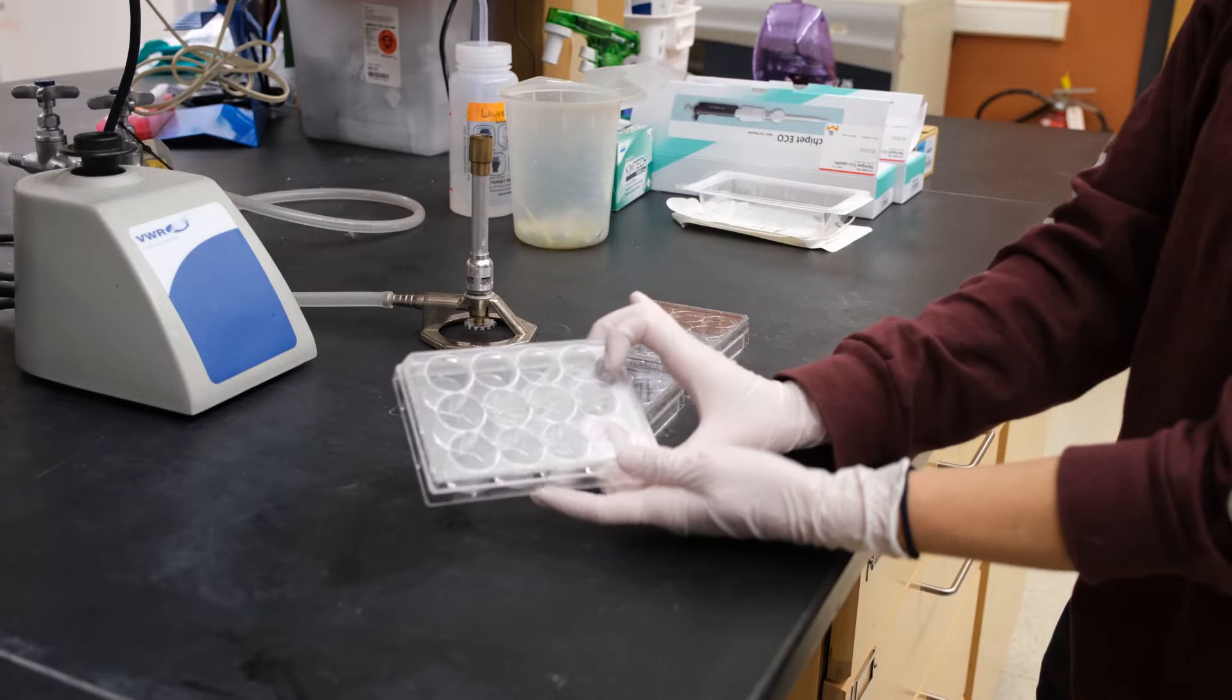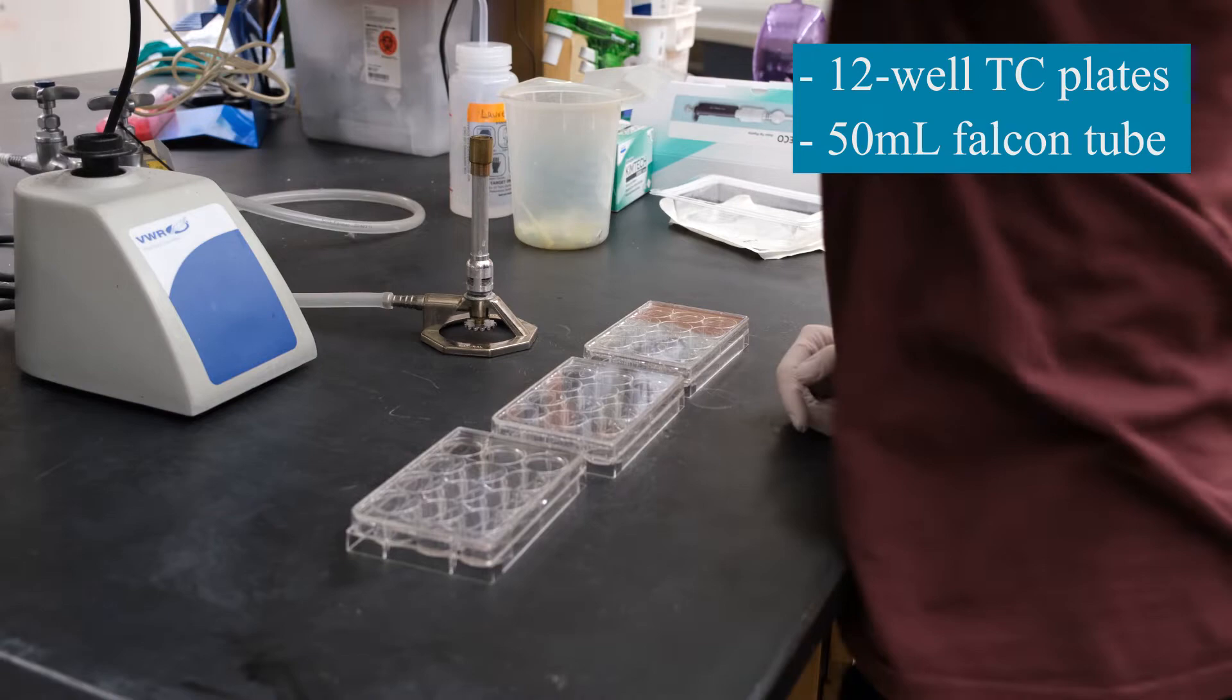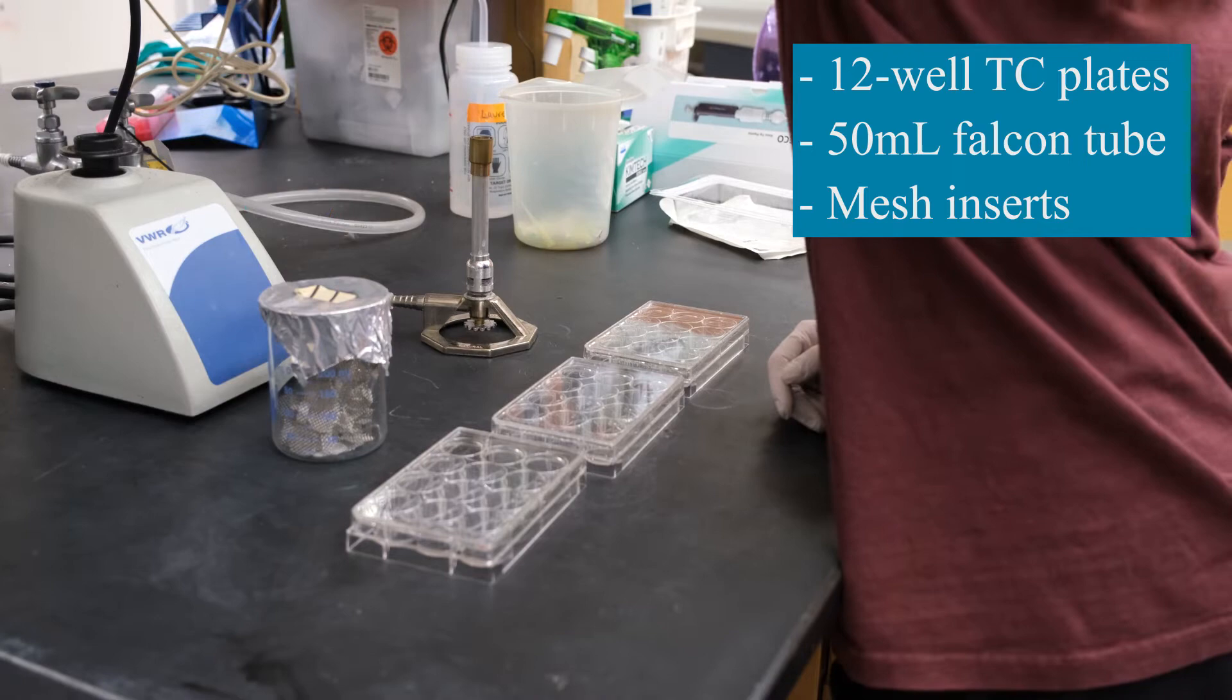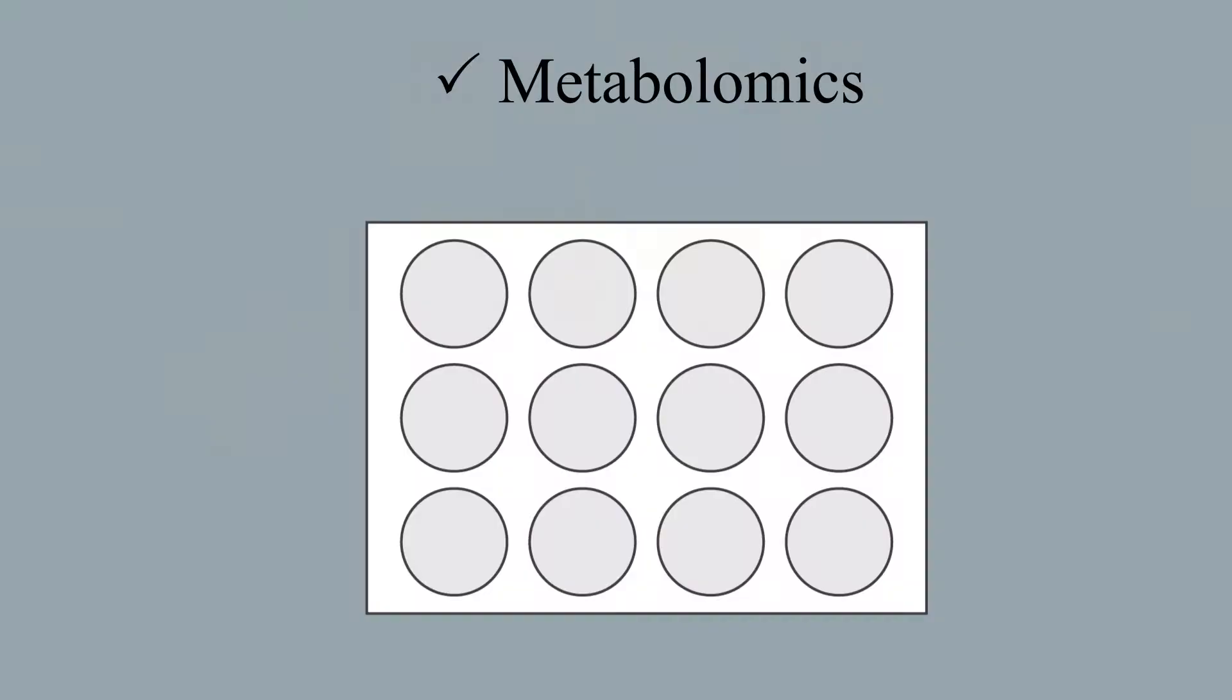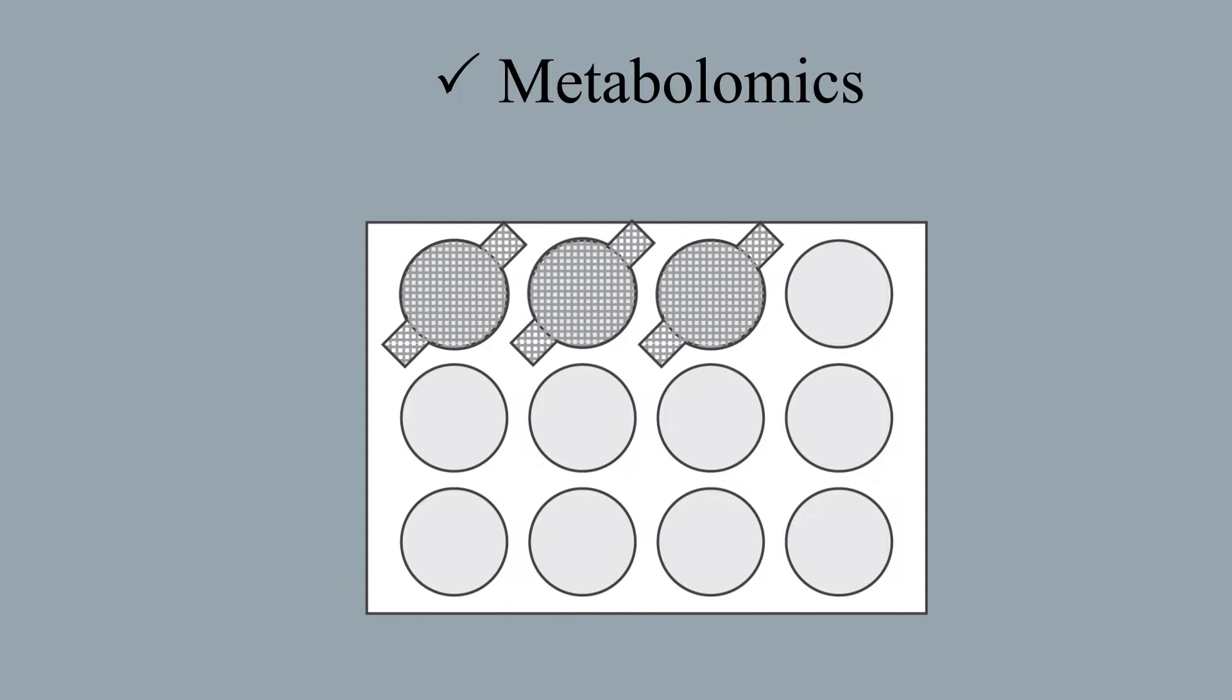While cultures are growing, we'll prepare our 12 well plates. For this you'll need sterile 12 well tissue culture plates, non-treated, a sterile 50 ml falcon tube, metal mesh pre-cut to fit into the wells of the plates and autoclaved. You'll also need forceps, a 5 ml pipette and tips, and a marker.